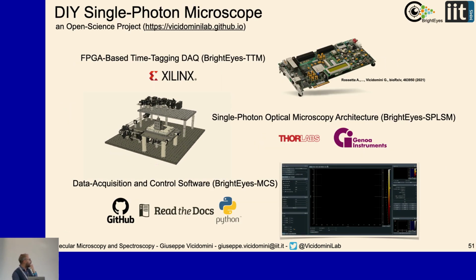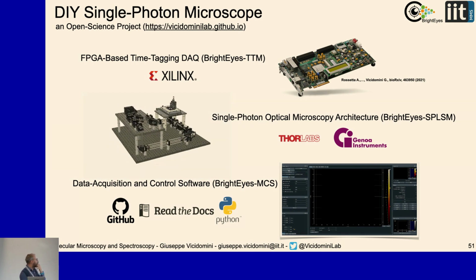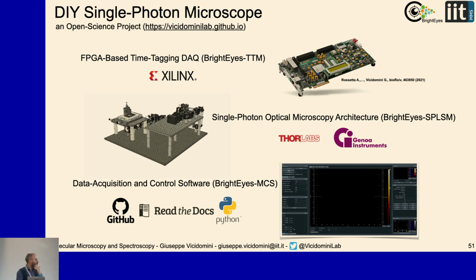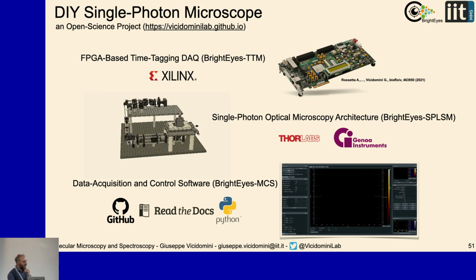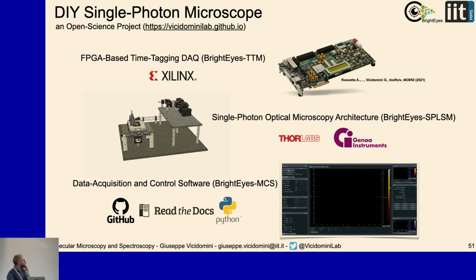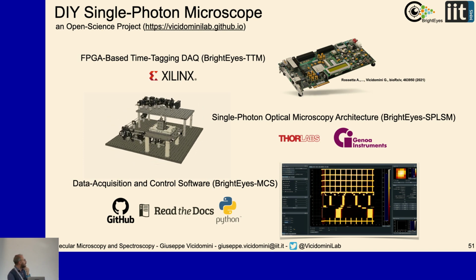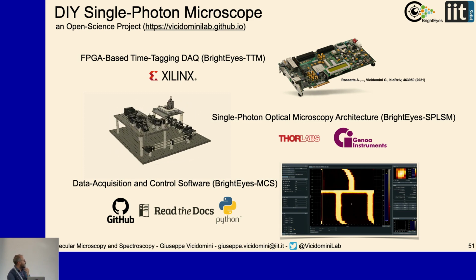Another thing that I'm really proud of and want to stress is that we think this can really be the future, and I hope that companies will follow us, but maybe there is no time, in the sense that when a technology is ready, it would be nice to have it in the lab immediately. So most of what I showed you is released as an open source project. Not only the time tagging system, but also the architecture.